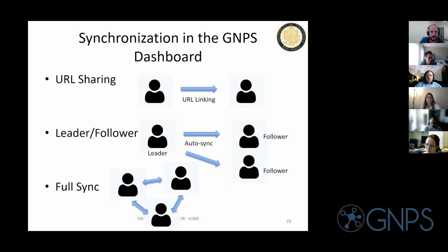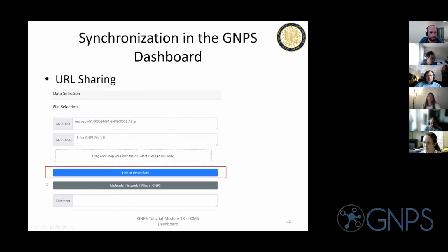Maybe showcase quickly how to generate the URL of a particular view. Yes, exactly. So I think that's this next slide here. So within the dashboard itself, first of all, we apologize, there's like a million different buttons and things you have to read and things tucked into some submenus.